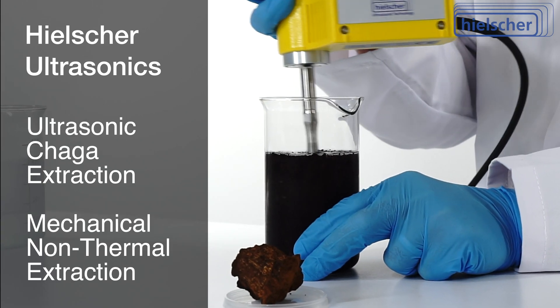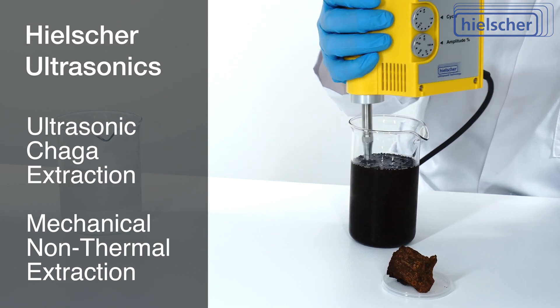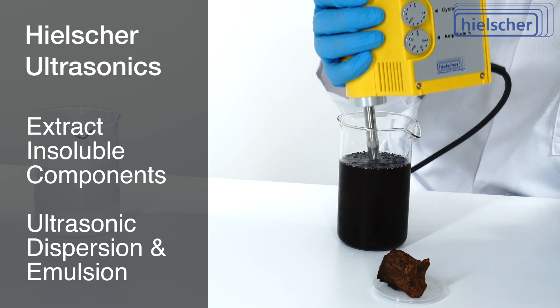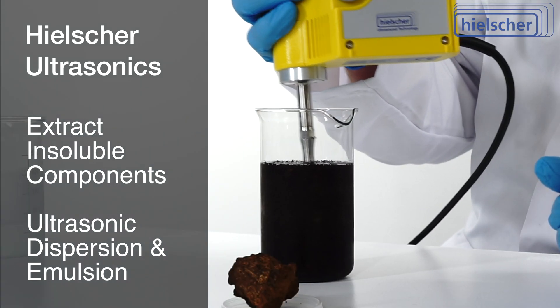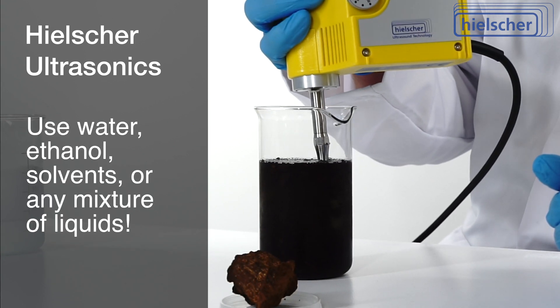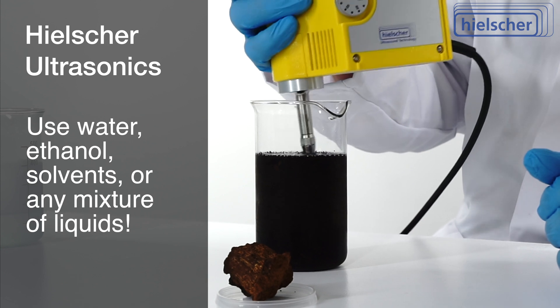The ultrasonic cold water extraction of chaga mushrooms is a purely mechanical, non-thermal extraction technique. Ultrasonication emulsifies or disperses insoluble components in the liquid phase. You can use any mixture of water and alcohol together with ultrasonic extraction.